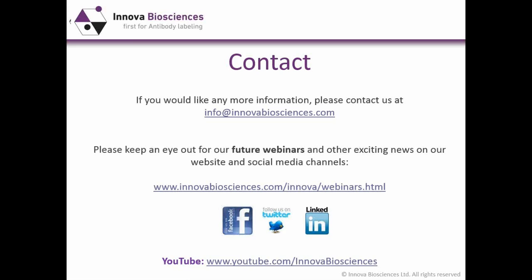Okay, thanks, Andy. Our next question is, can I just use the BSA removal kit instead of protein A to purify my monoclonal from cell culture? Okay, the answer to that one is unfortunately not. We've designed the BSA removal kit to remove BSA that has been added as a stabilizer to a previously purified antibody. In a more complex environment, such as a cell culture supernatant, you will succeed in removing much of the albumin present, but you'll probably co-purify other proteins with the antibody as well, so we wouldn't recommend it for that use.